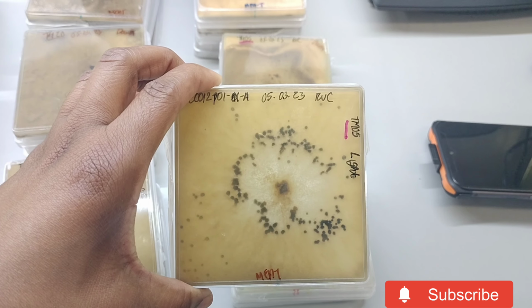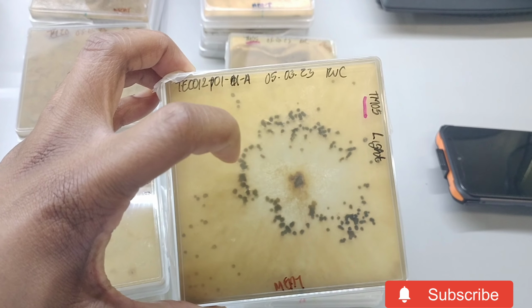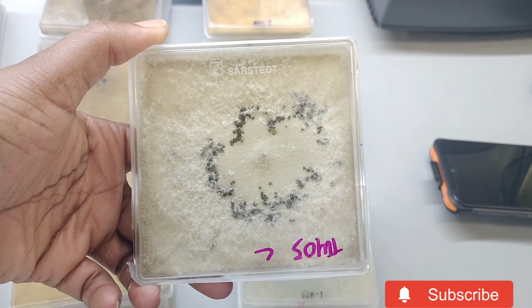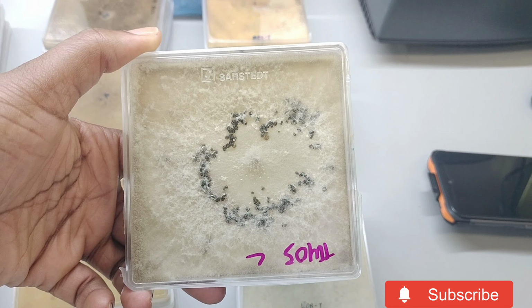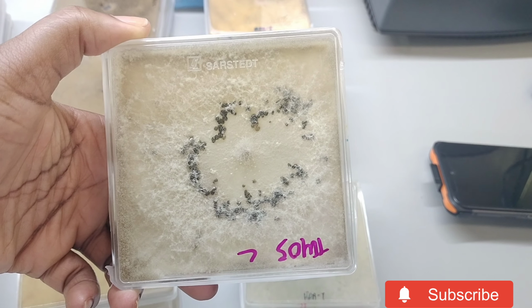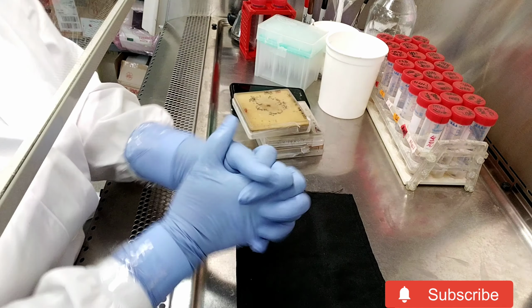And this already has sclerotia. Those black structures are survival structures. So this pathogen can stay in the soil or in the parts that it infects for a long time by using those hard structures. So I'm going to turn on the BSC, take it out of the UV cycle, and then start working. It is 8 o'clock, and let's see if I'll finish before 4 or 5.